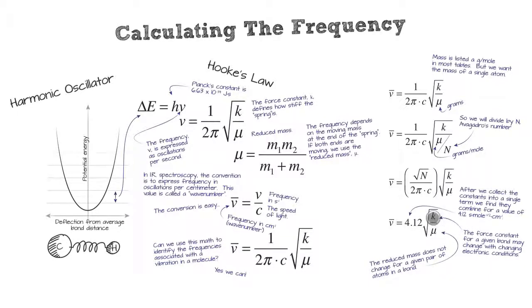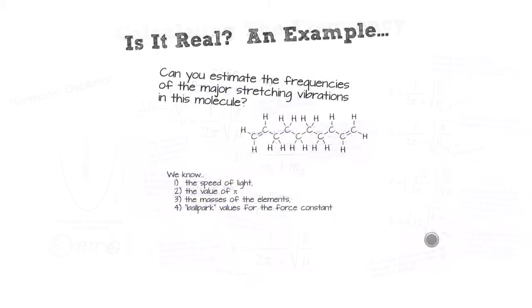So this is why we can use IR spectroscopy to interpret structure. We can actually see slight differences in frequency within the same kind of bonds. Of course, we see big differences in frequencies if the atoms have changed. And so we can actually find functional groups, and we can see if they're a little different and what environment they're in, to a limited extent.